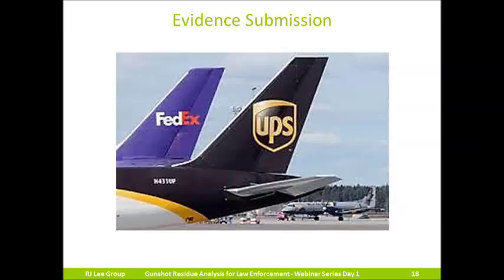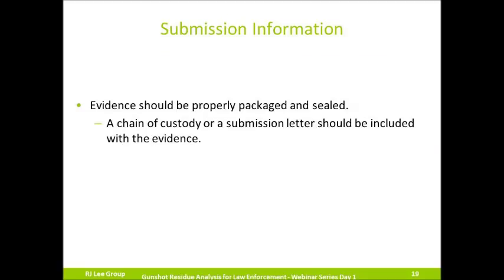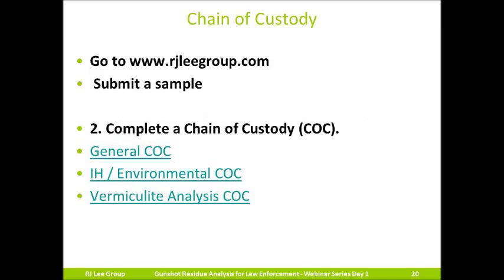Today I'm going to go over the proper procedures for submitting evidence to our laboratory for analysis. As Mike stated, all evidence should be properly packaged and sealed. A chain of custody or a submission letter should be included with the evidence. Let's talk about the chain of custody. If your agency has a chain of custody, please enclose it with the evidence. If you need to obtain one, you can download one from our website.